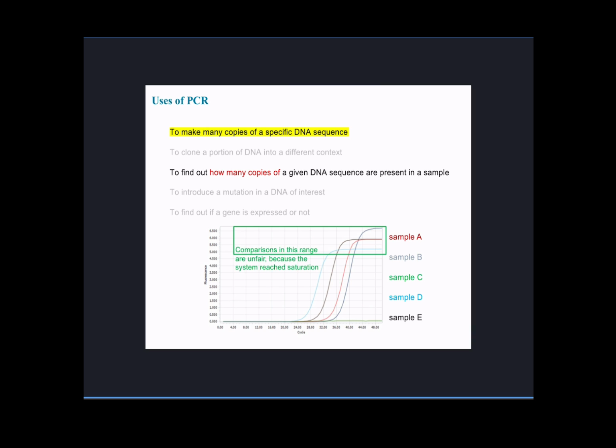So what we need to do is look a little earlier, where the fluorescences across the samples have not reached saturation, where we're still in the linear range. That's exactly what we need to do: look at these reactions that are happening in parallel before they've reached saturation. The problem is that before they reach saturation, it is hard for the human eye to be quantitative.